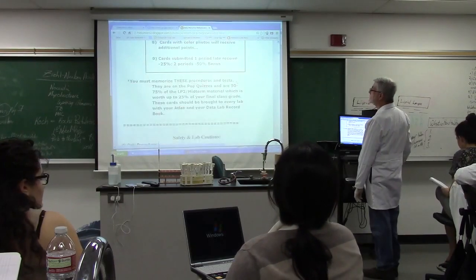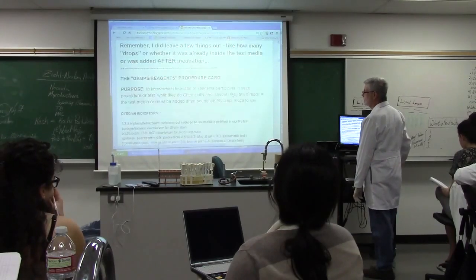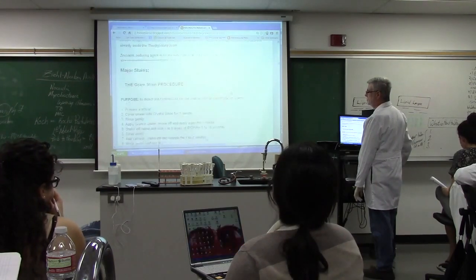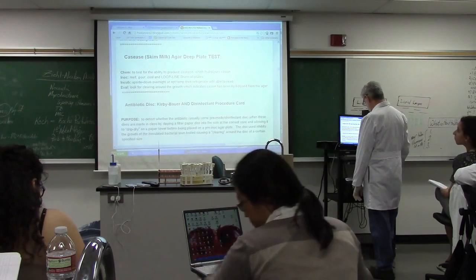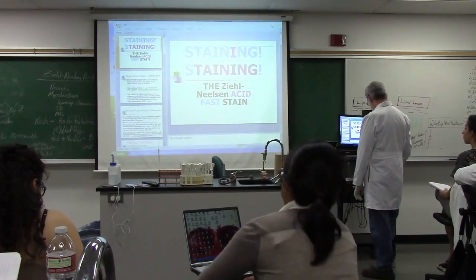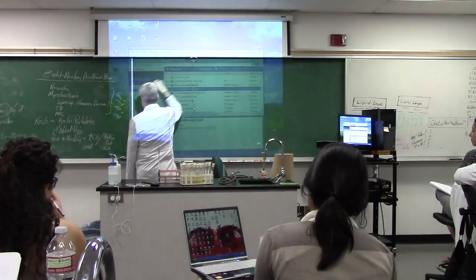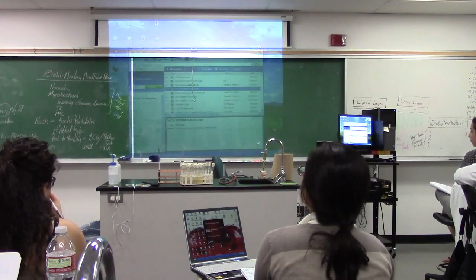And if you go down to the bottom of the page, it has all the cards you should have, although these are not like A-set cards, they're B-set cards. And one's for drops, the one for gram stain, and so forth. So, anyway, that's that. I don't want to belabor that anymore. So let's go back to what we're doing today. We're going to do everything acid-fast stain today.